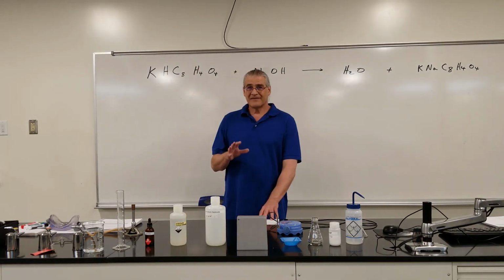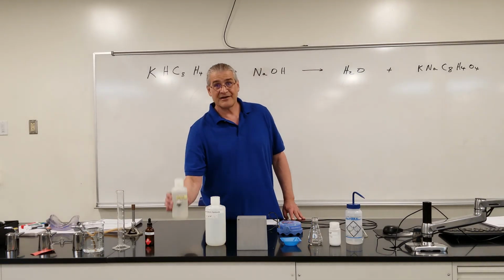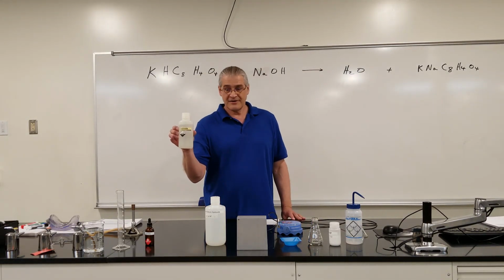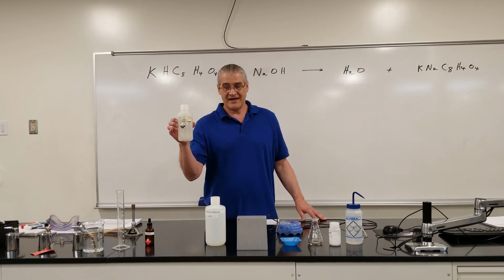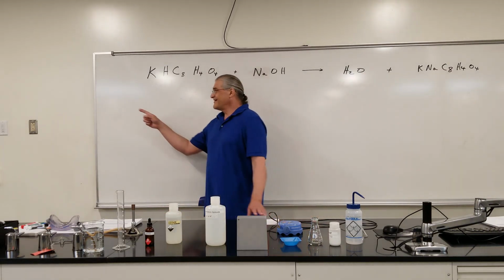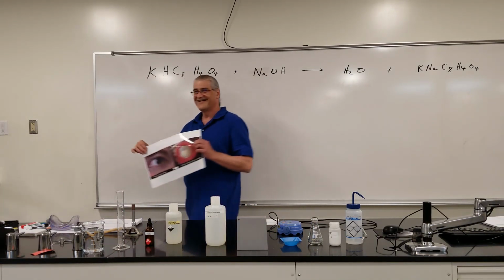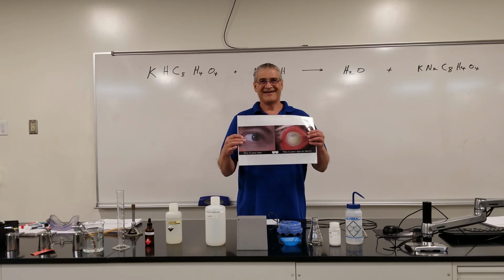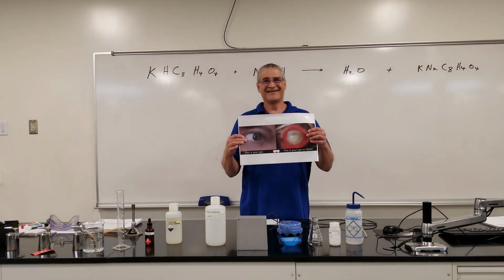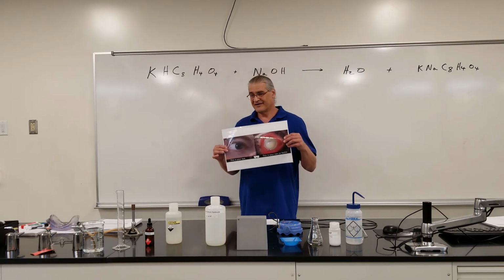Before we get on with that, though, a little safety note. Sodium hydroxide is one of the more common laboratory reagents you'll encounter. It's common household lye. That said, it's a wee bit dangerous. You might see our graphic here. This is your eye. This is your eye on sodium hydroxide. It can blind you in a matter of minutes if it gets in your eye.